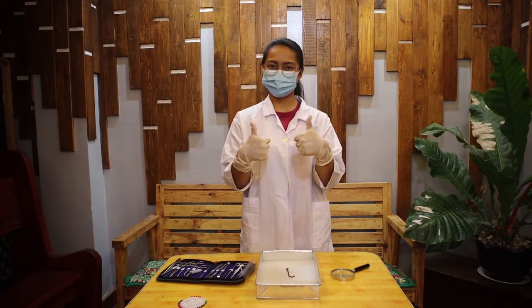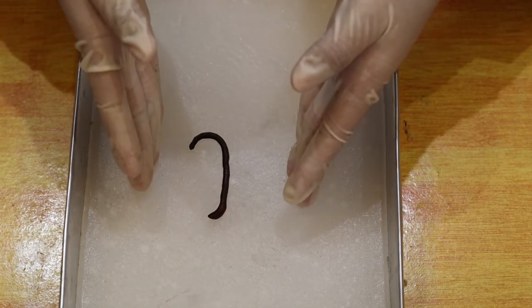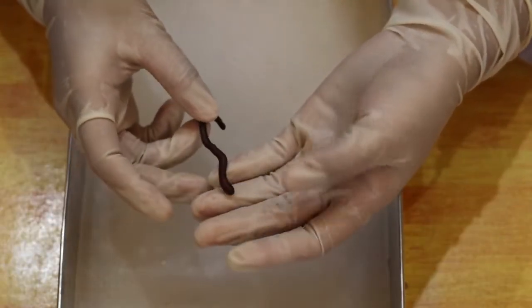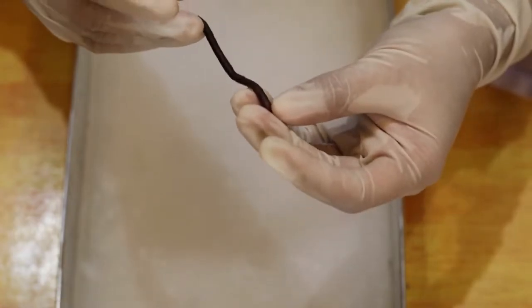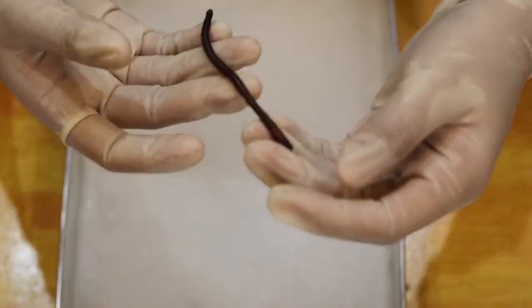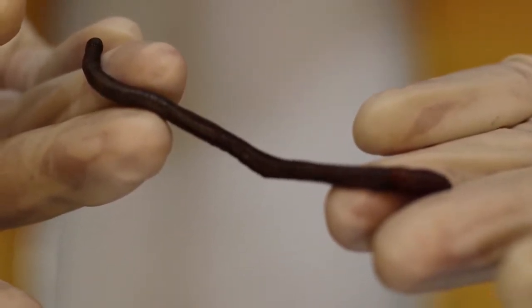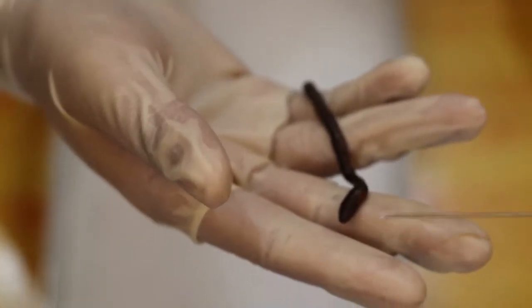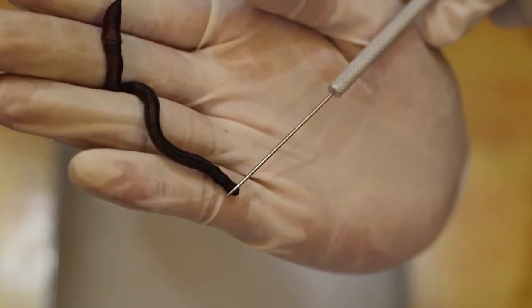So let's start. First, we are going to observe and determine the different parts of the external anatomy of the earthworm. So this is our model for today. Let's observe first the color of this earthworm. The color of this earthworm is a red brownish. You can see it? A red brownish.